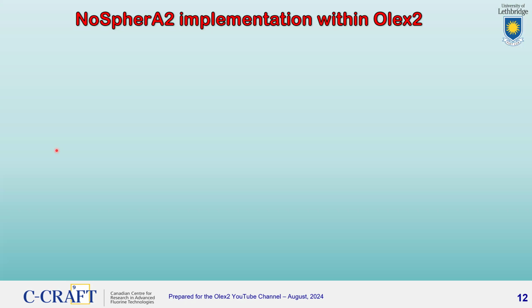And so what NoSpherA2 does is it uses quantum crystallography to get beyond these limitations, and now I'm going to explain how it does that. First of all, it is implemented within the OLEX2 GUI, fully integrated within that software. You don't have to install anything new, although you do need to have access to quantum mechanics software.